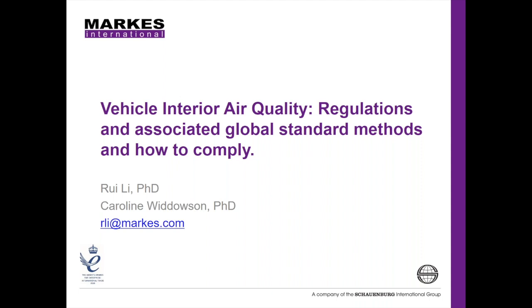During this webinar, we'll explore vehicle interior emissions regulations and methods for VOC analysis.